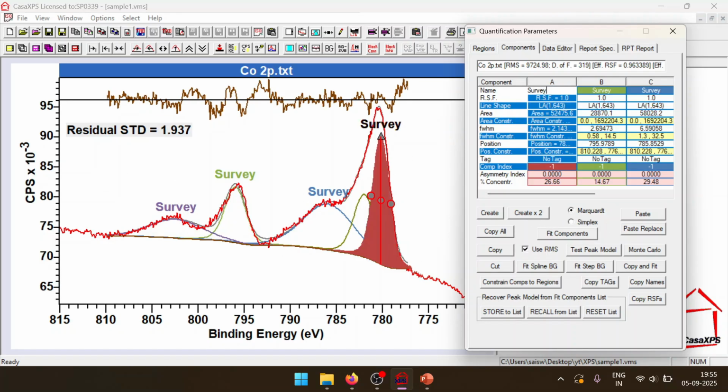This is done. You can name them if you want. If you don't, there's no need. CO2P1 by 2, or whatever it is. I'm just randomly naming. Always press enter. Clicking elsewhere does not work. It's just for your labeling in here, but anyway, when you plot in Origin, it doesn't make much of a difference. So up to you.